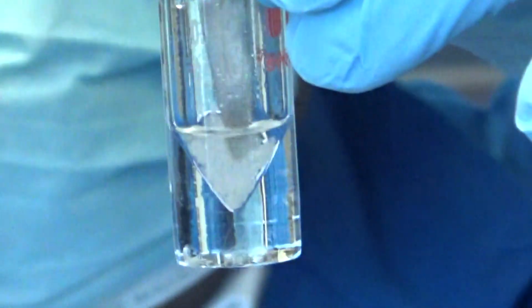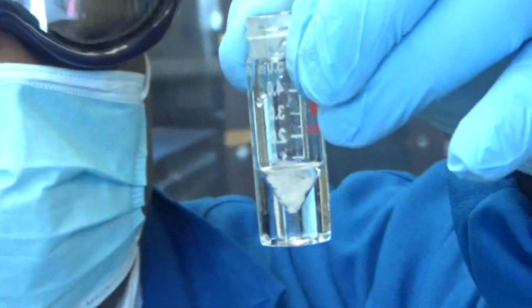Smush it up. Agitate it with a spatula a bit, and that'll make sure it's all dried up and all the water gets absorbed into the salt. Okay. Gone. Very good. You can leave that here like that.